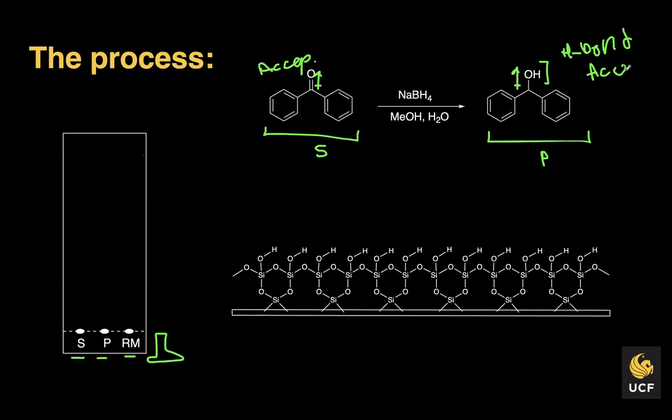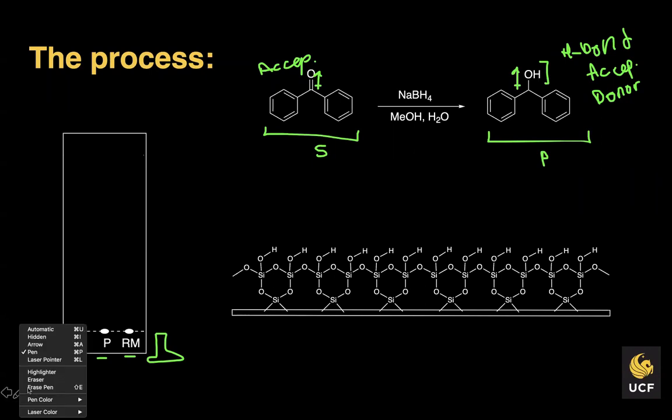Okay. So would the product stick more to the plate because it's more polar? In general, yes. Silica is used for separation that we call normal phase, which just means that it is separating polar compounds from nonpolars with an affinity for polar compounds.